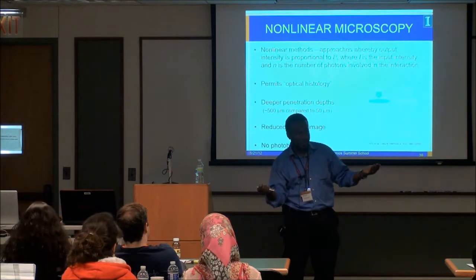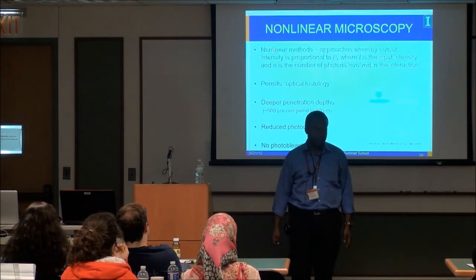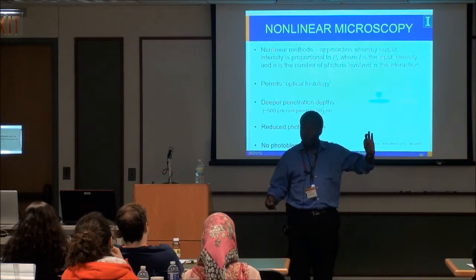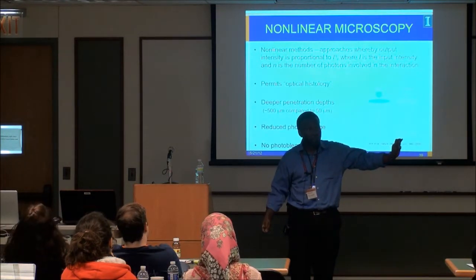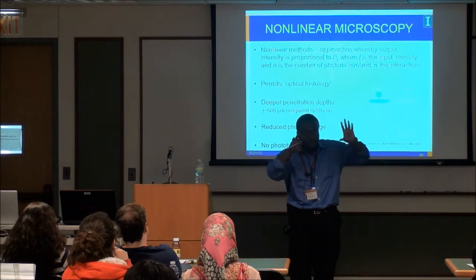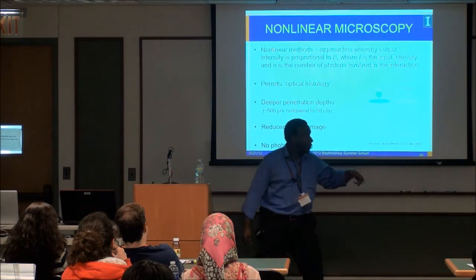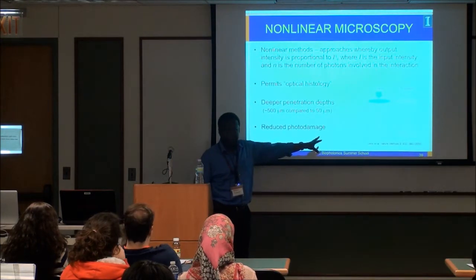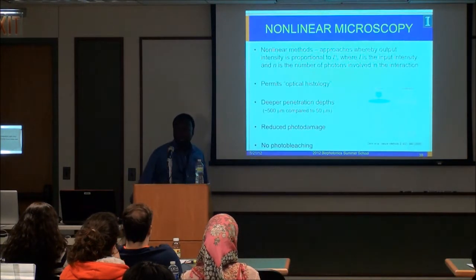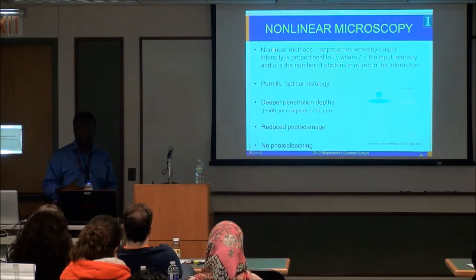So someone recognized that and said, what if I take that same input light and start to shape the input wavefront? You can do it in a blind way using optimization routines. Now, all of a sudden, that light can be focused through that scattering medium. So instead of just randomized speckle, you have a focused intensity spot. Very recently, like this year, people have applied that to imaging. It's the coolest thing. So that's what I'm saying: there are more and more advances happening all the time if people think about the other degrees of freedom of the light itself.